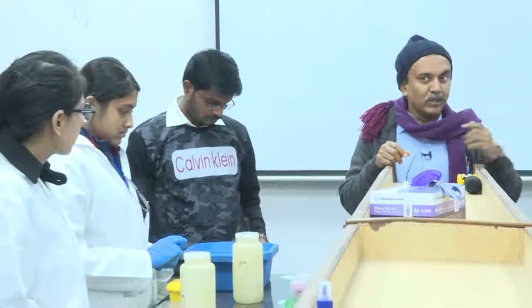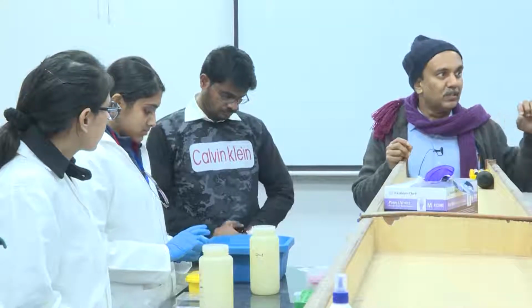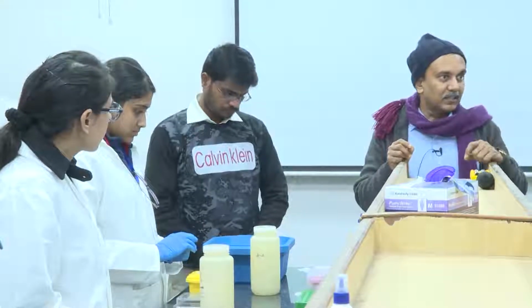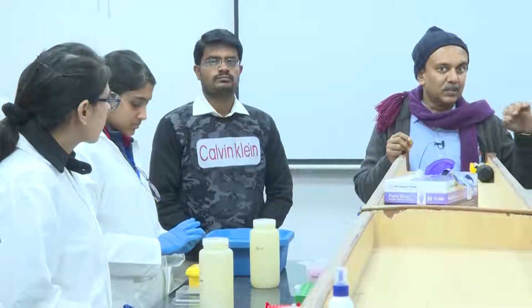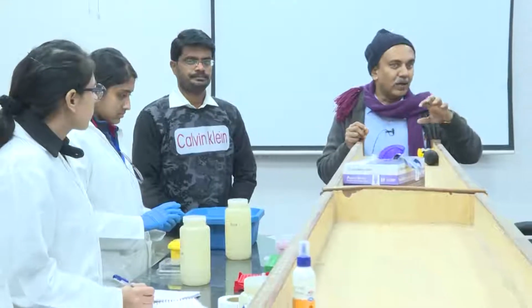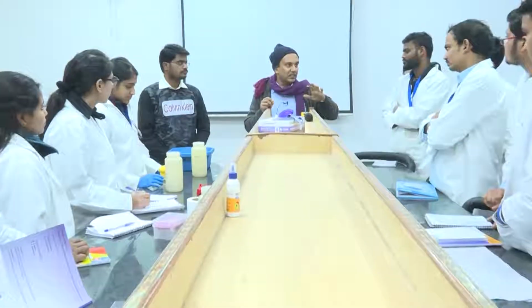But as I told you in the class, before you go for the extraction, you actually quantify the sample which you are taking for extraction. In our laboratory, what we normally do is we use kits for extracting DNA. Of course, you can also use other methods, but if you use a kit, it's easy and you are getting a dependable, reliable DNA extracted from the sample.